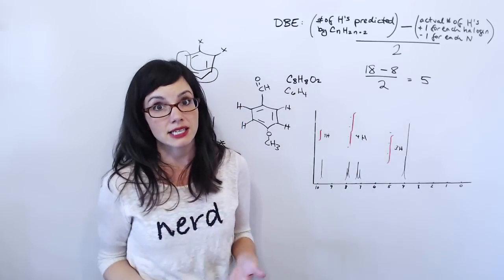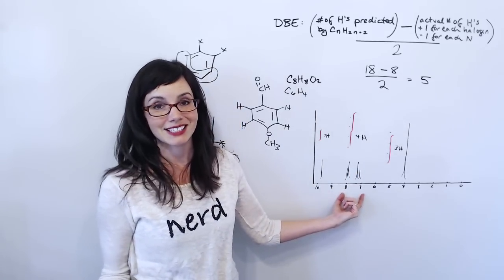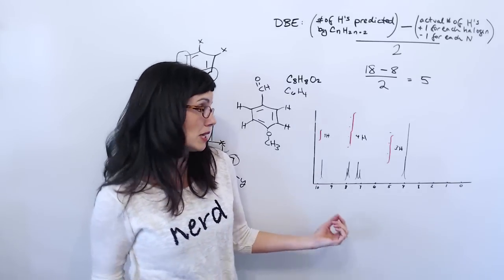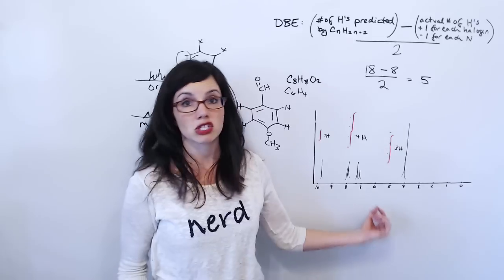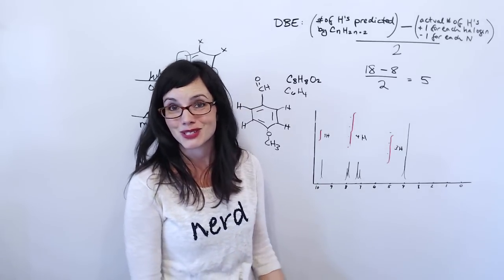And the reason why I didn't do that here is because we know that all of this belongs to benzene, and so we're just going to treat it all as one signal. But if this had been in another part of the spectrum, we would have counted those 2 separately and treated them as 2 separate signals. And I will handle something like that in another video, so just stay tuned.